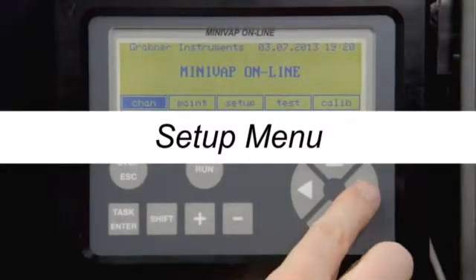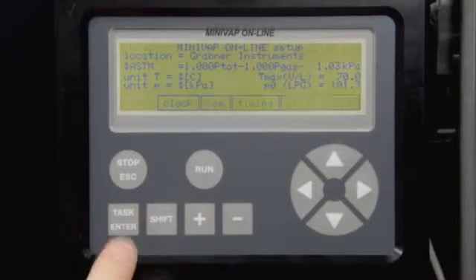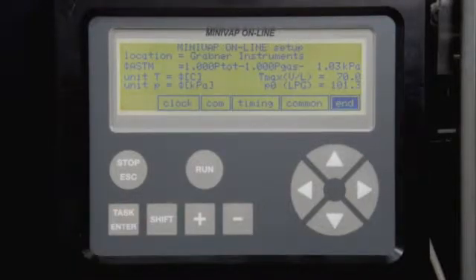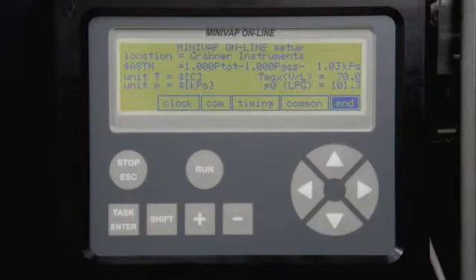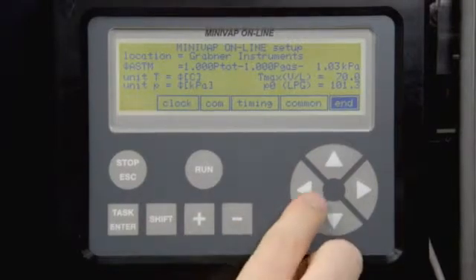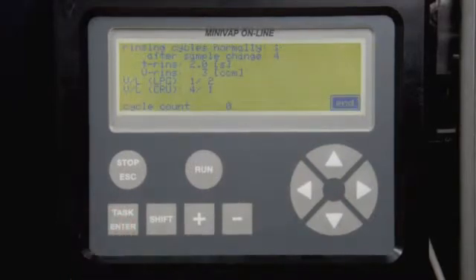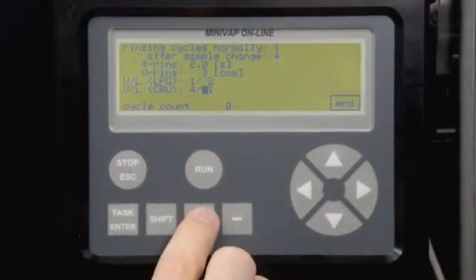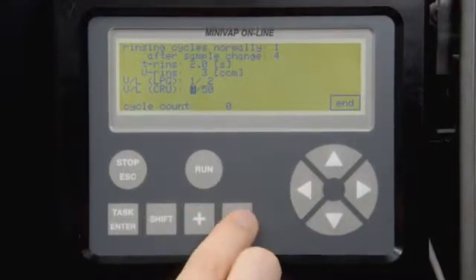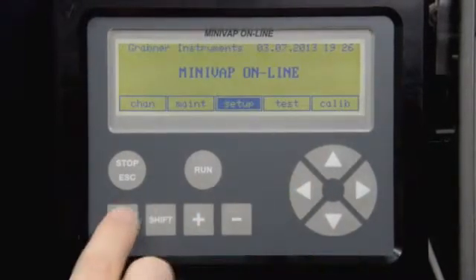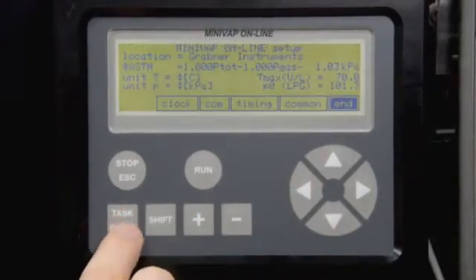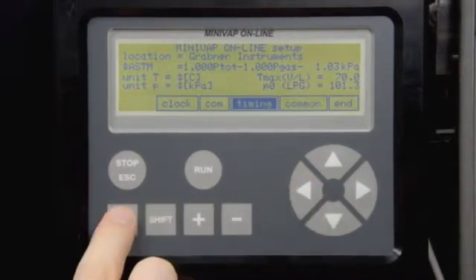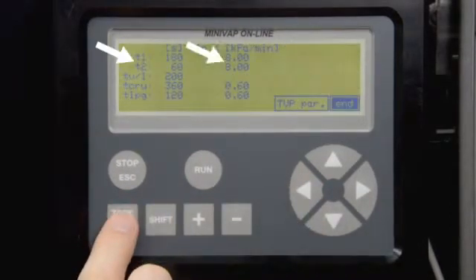Setup menu. The Setup menu allows the user to manage methods and settings, like correlation formulas, temperature and pressure units. Go to Common to change the number of rinsing cycles and the rinsing volume or the V over L ratio for crude oil and LPG measurements. Go to Timing to change equilibrium times and pressure limits for measuring methods.